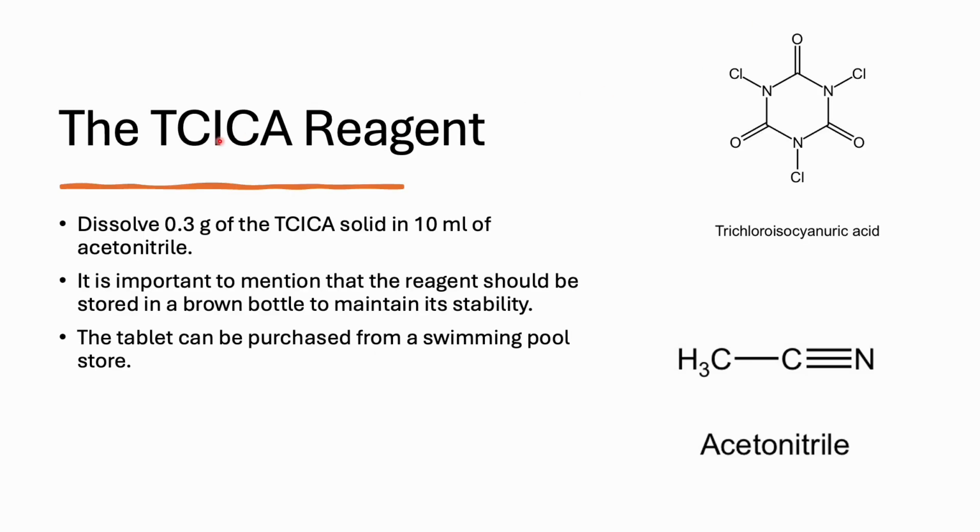In order to prepare the TCICA reagent, whose structure is given here, we need to dissolve 0.3 grams of the TCICA solid in 10 milliliters of acetonitrile, shown here. It is important to mention that, in order to maintain the stability of this reagent, it should be stored in a brown bottle, and the tablet can be purchased from any swimming pool store.